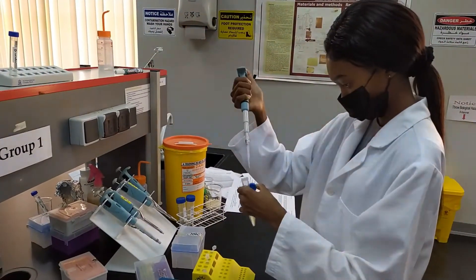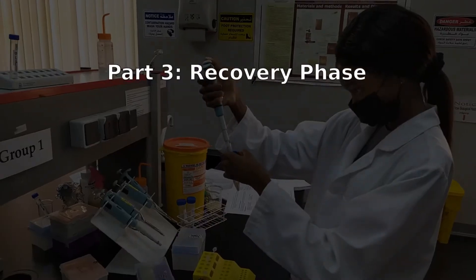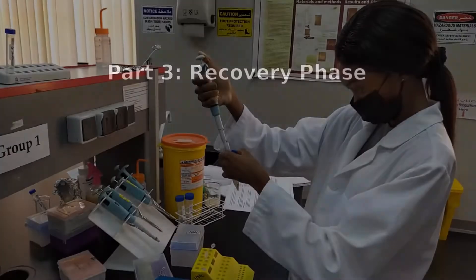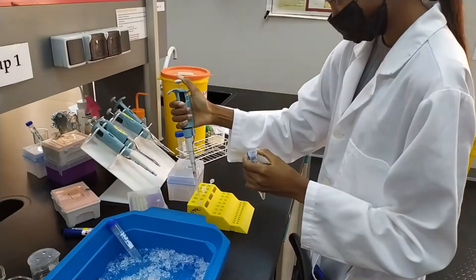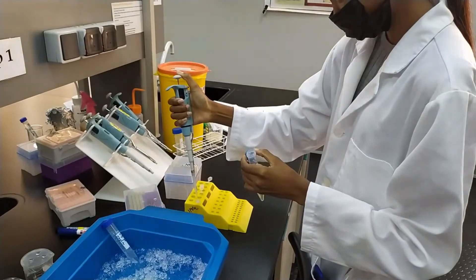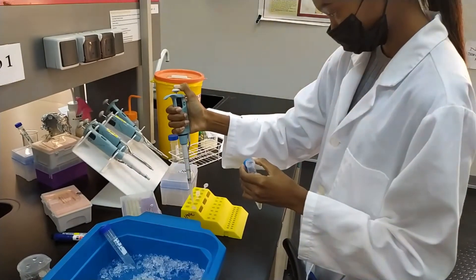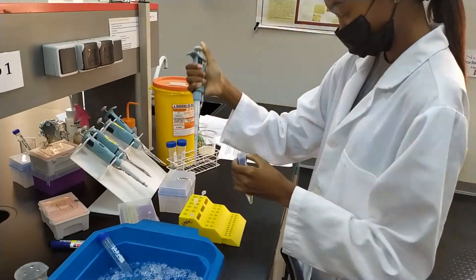Following this heat shock, you will enter part 3 of this procedure — the recovery phase. Here you will add 500 microliters of plain LB into each tube and put your tubes at 37 degrees Celsius for about 30 minutes. This will allow the bacterial cells to recover from the rough treatment they have just received.